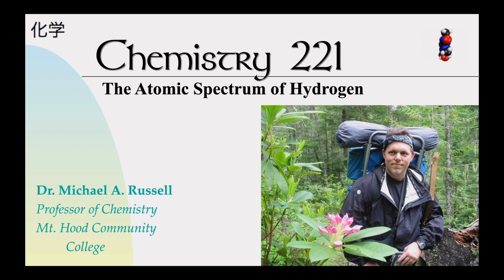Normally, if this class is meeting or would meet in an actual lab room, this lab is quite different from the other labs. We don't really mix chemicals and measure grams and milliliters, stuff like that. This lab is all about light and the energy essentially created from a hydrogen discharge tube. A discharge tube is basically a fancy name for a type of light bulb. Light comes out when electricity is added to it. It's pretty cool. We'll also get to talk about the Bohr model of the atom. So without further ado, let's see what this lab has to offer.